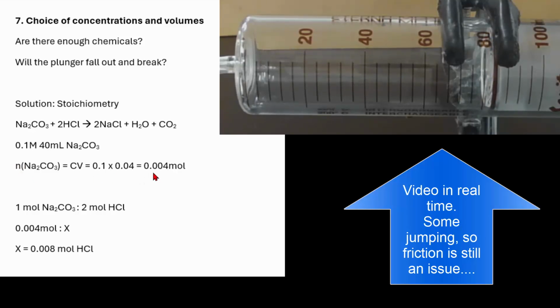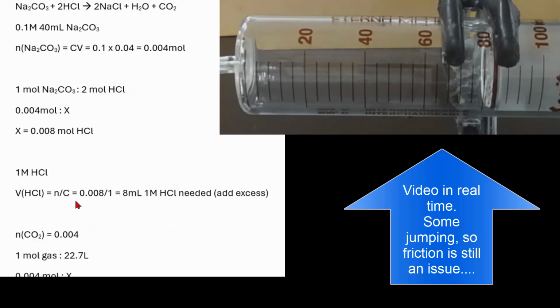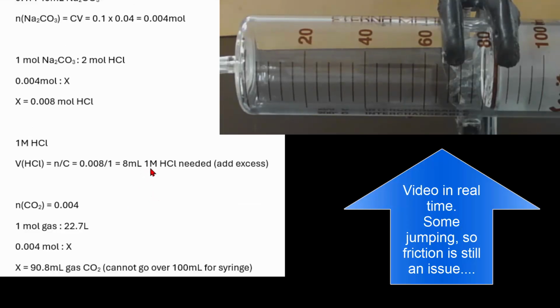So just checking the calculations, because you can't trust AI for that either. I need about, this is the number of moles. I'm going to put that many mils in. And that's why I didn't do a large to a small, because I'm just using the chemicals that I have on hand. But I had a mixer anyway. So that works out, I need this many moles of hydrochloric acid, so I need about 8 mils of 1 molar. I could have gone for 0.01 and put heaps in there, but I did mark off using 20 mil aliquots of the dropping funnel, so that I could have filled it up and just released, without having to top up.